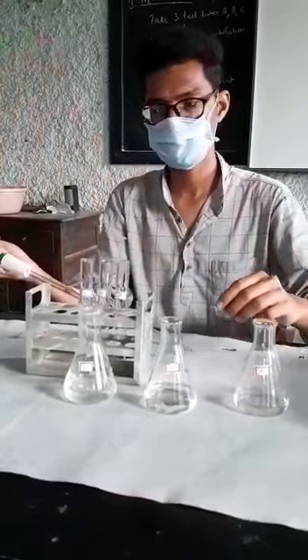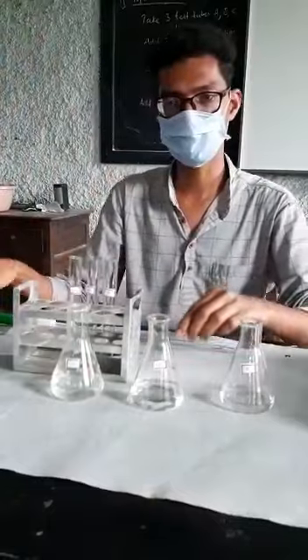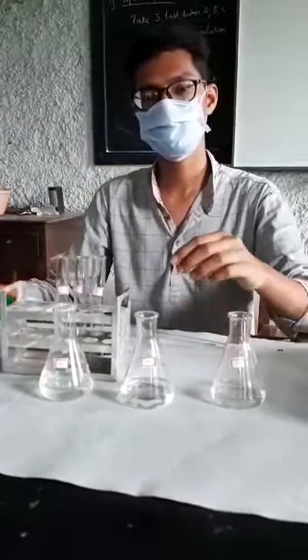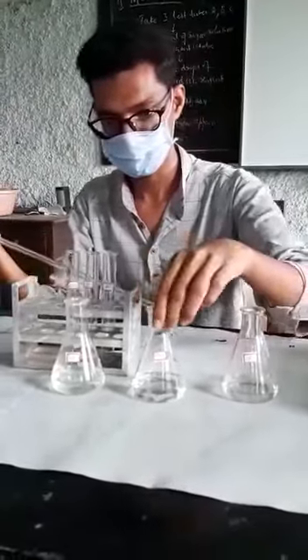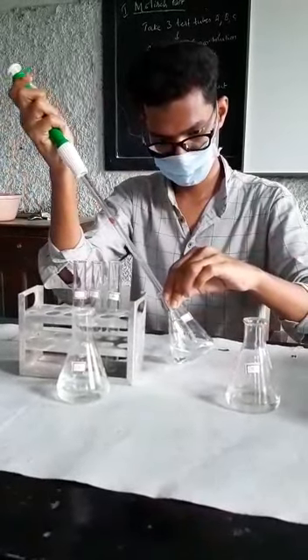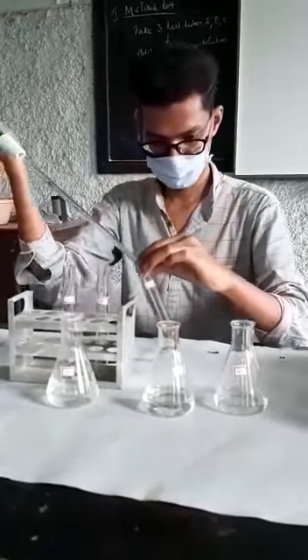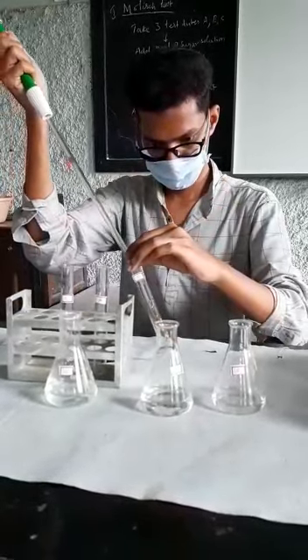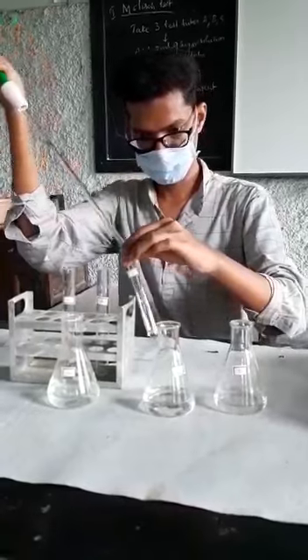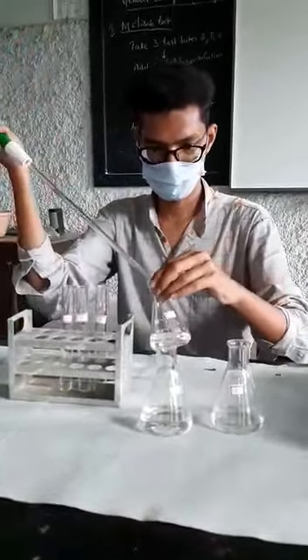Then he will take sample B. Next one, no need, you can use the same pipette. Sample B in B tube. And sample A in A tube.